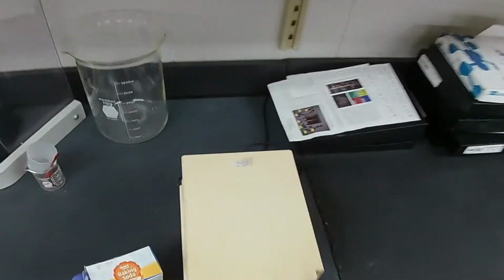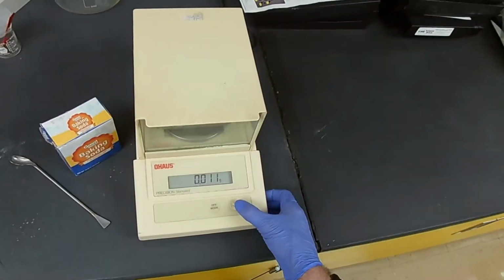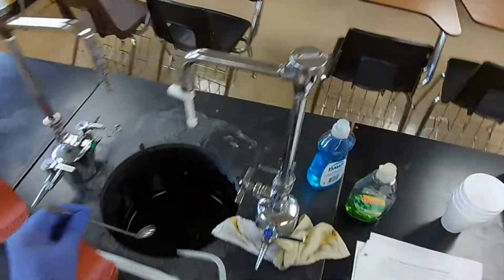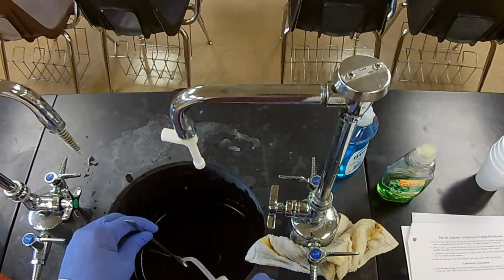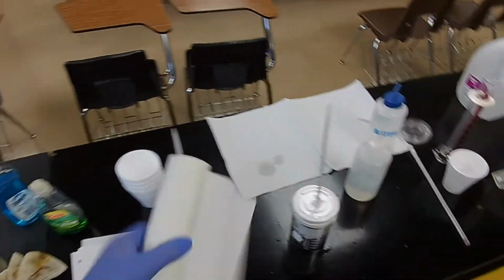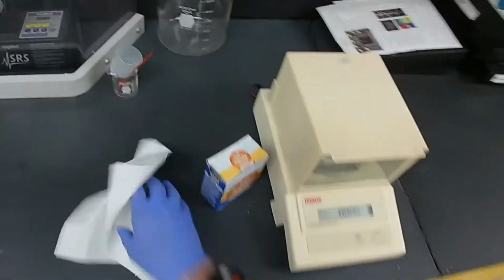7 grams. So we'll get as close to 7 grams as we can after we set the 0 and clean our spatula. All right, so I need there. Okay, we're zeroed.